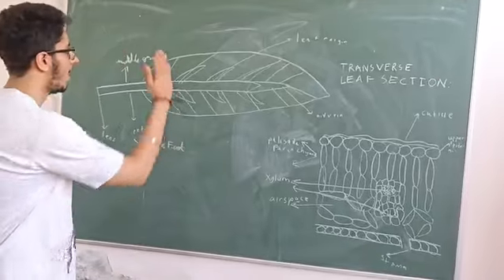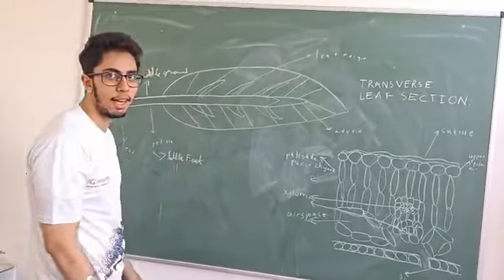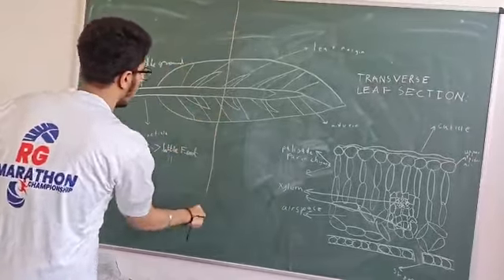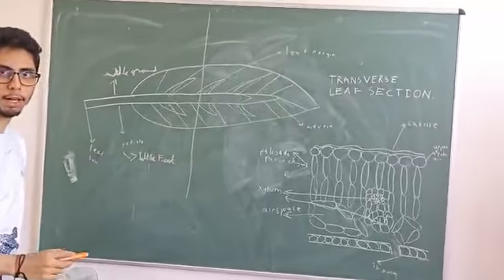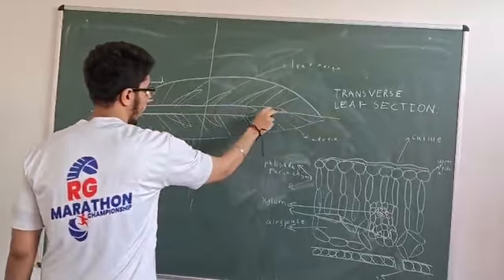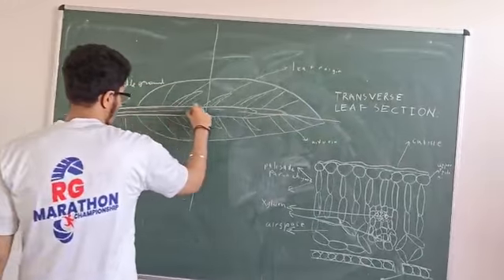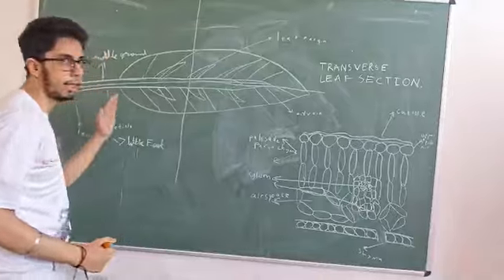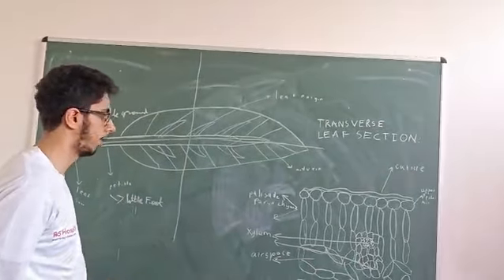So yeah. So a transverse section, right? Transverse basically means that we're cutting across it, because trans means across, right? And longitudinal means we're going to cut it like this, in a lengthwise way. So I hope you get it, right? We are cutting it like this for the longitudinal section if we want one, and we are cutting it like this if we want a transverse section.